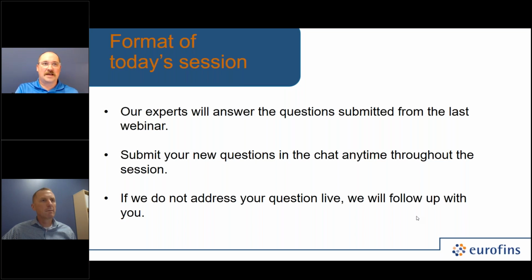We could have run this assay 100 years ago and got the same number that we're getting today, to something more sophisticated, where we are able to differentiate strains in a blend, where we can get more precise results, where we can get real-time data to help drive decision making in a faster paced environment. There's obviously, I touched on a number of hurdles associated with that paradigm shift and making it happen.